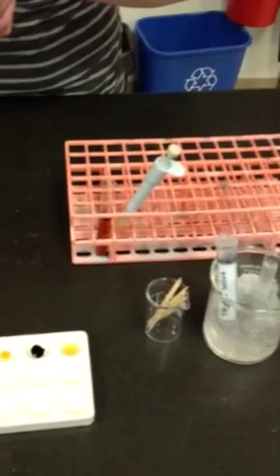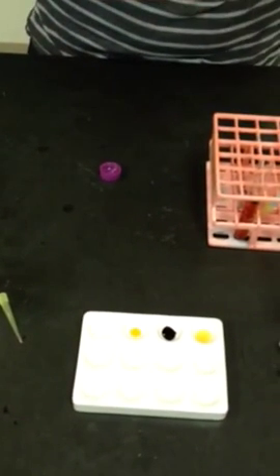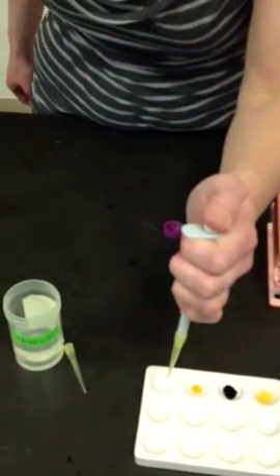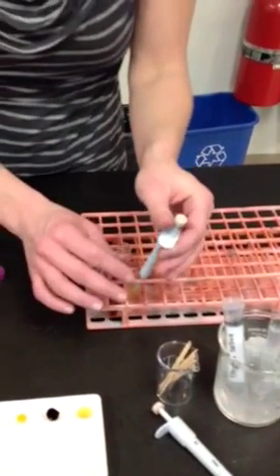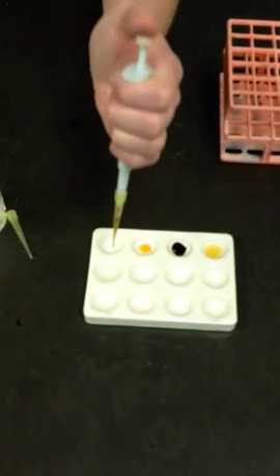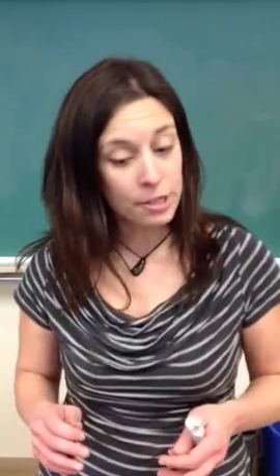There we go. And I will also test the commercial amylase that I purchased for this lab with a clean tip also. Got it over here in the well. So when all these reagents are together, it's not blue. And now let's try putting a drop of iodine, see what happens. And it's definitely not blue again. So we have confirmation that the only reagent we use that reacts with iodine and becomes dark blue is starch.